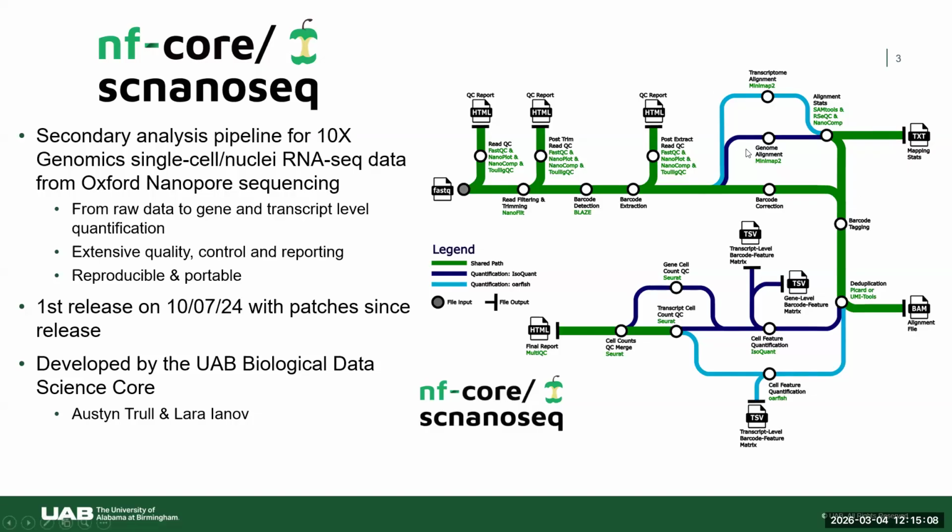With that being said, these QC steps can be skipped if you want, and we provide different options on purpose because some of these tools will perform well with long-read data, but some won't. So you don't need to do all three, you can just choose one. The very first read processing step is quality filtering with a tool called NanoFilt, because this is still data that can suffer from quality issues, as I discussed earlier.